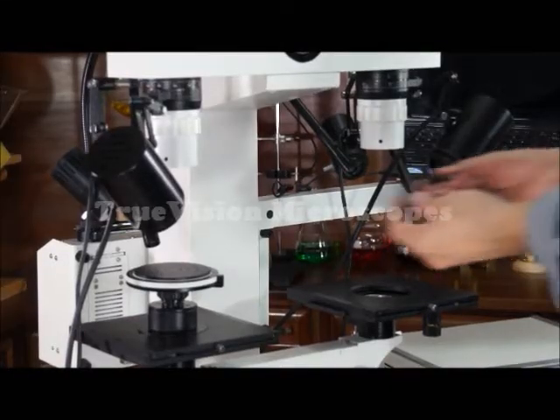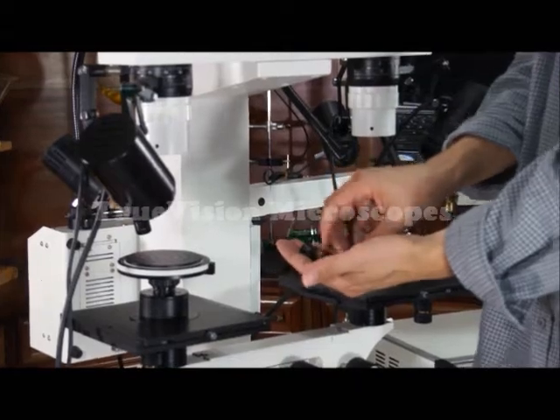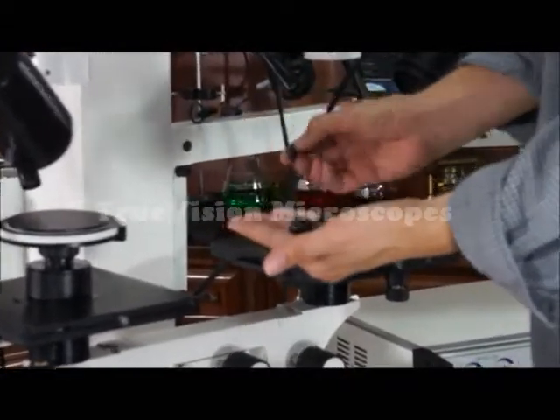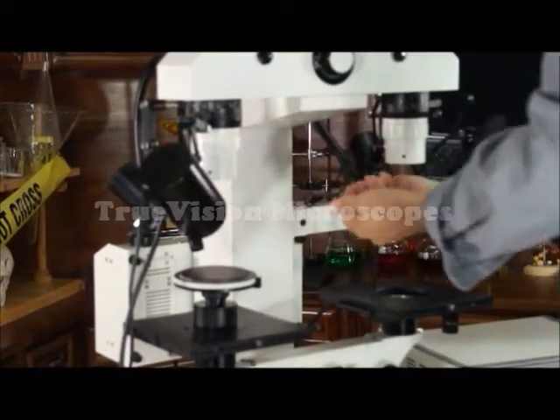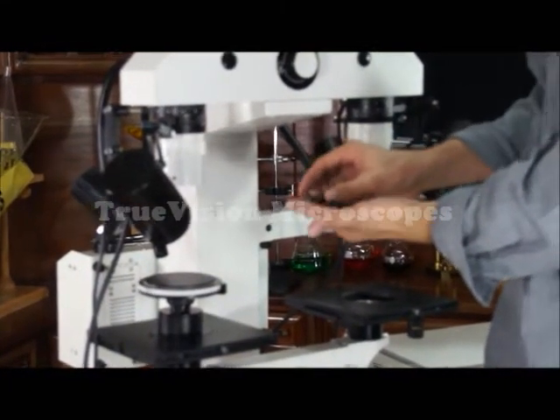These are UV and infrared tips, filters. These tips go to the fiber optic. They screw into them. UV and infrared.